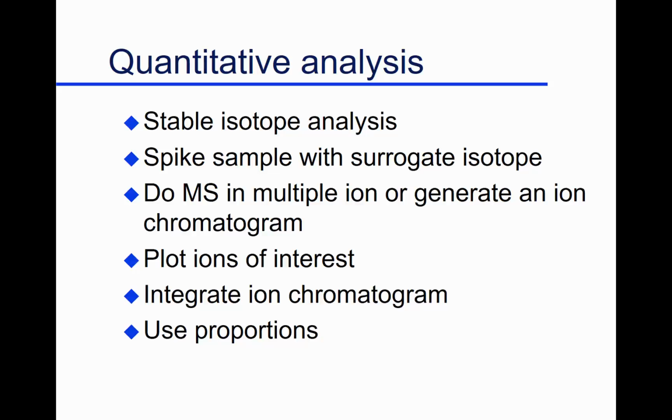So let's say in my business, I'm interested in benzaldehyde, cherry flavor. It's formed during the Maillard browning reaction. So I really want to measure benzaldehyde that's in my sample for some reason. Well, if I were going to have some kind of a reference compound to put in my sample, some reference for quantitation, I know my reference is this much, my peak of benzaldehyde is this much, can I use that as a key?